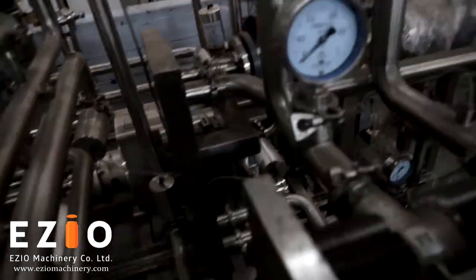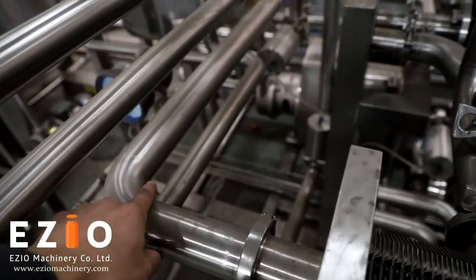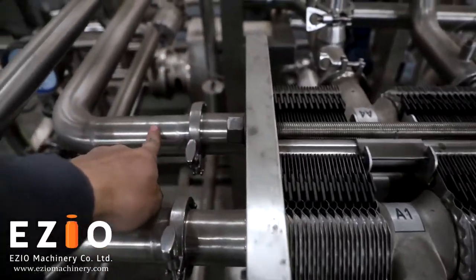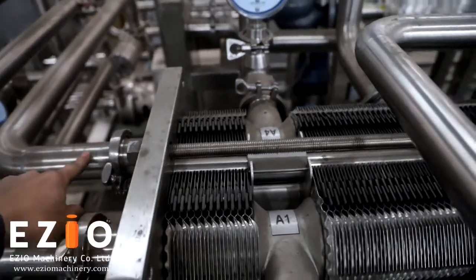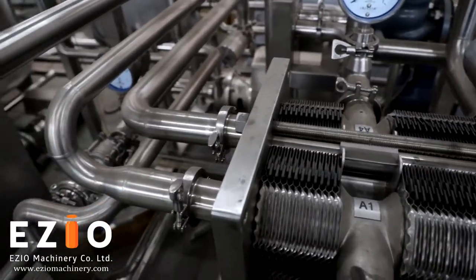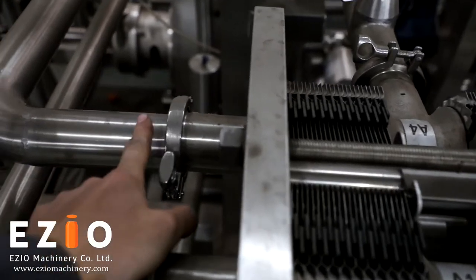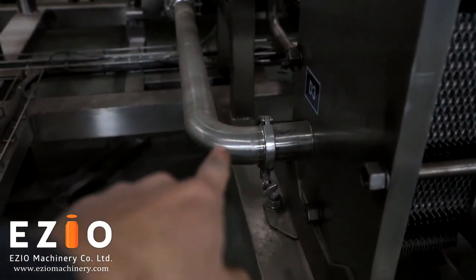This is where the cold water comes from. The cold water comes in here to cool down your product at the end. If your product is juice, you don't need chilled water — normal cold water is fine. But if your outlet temperature needs to be very low, connect the cold water here, and it exits from there to complete the circuit.